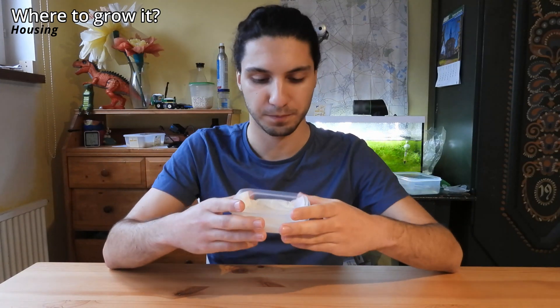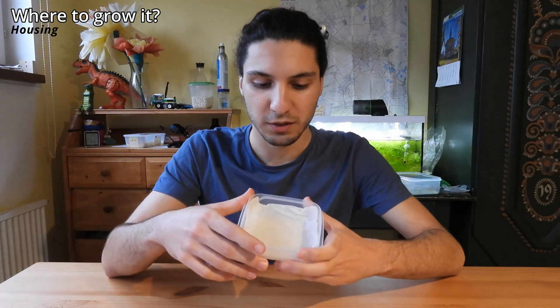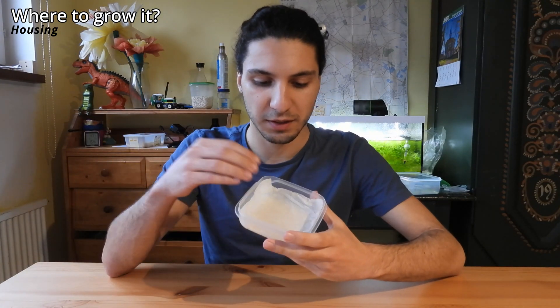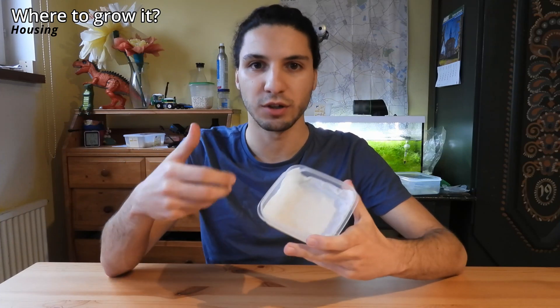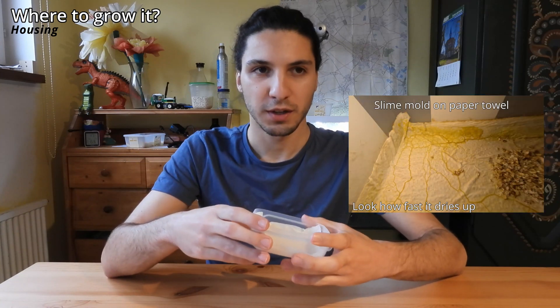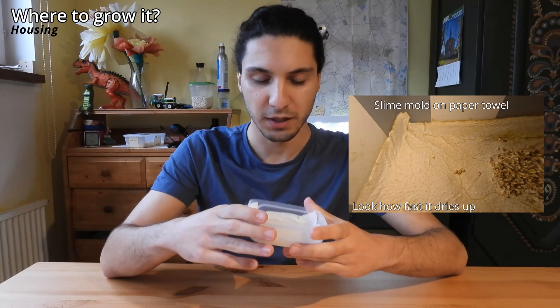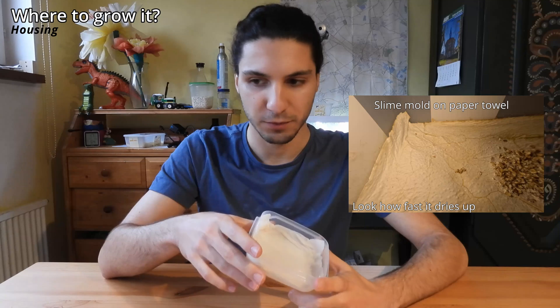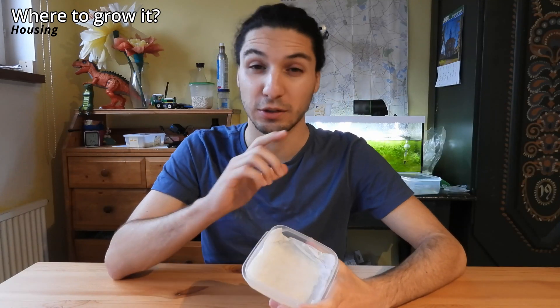The biggest disadvantage of the paper method — though it could also be an advantage depending on what you want to do — is that you have to keep it moist all the time. It doesn't store a lot of water, which means it can dry out pretty fast, like in one or two days at room temperature. So if you're careless or forget to add water, you could easily dry it out and stop growing your slime mold.